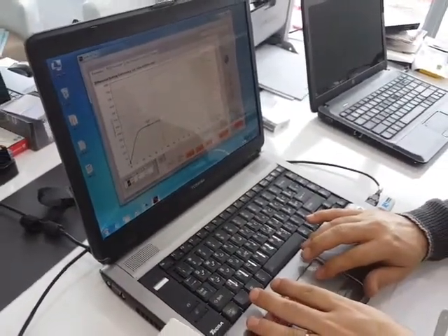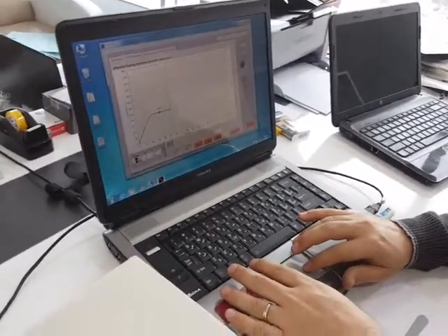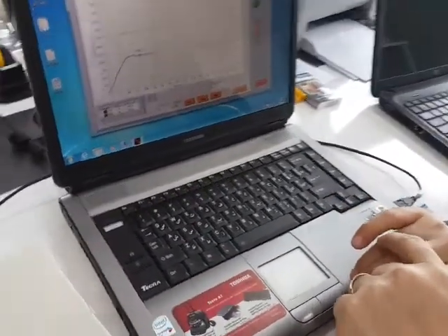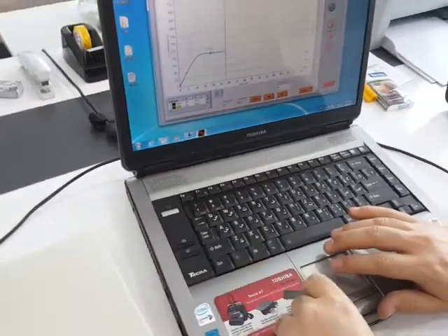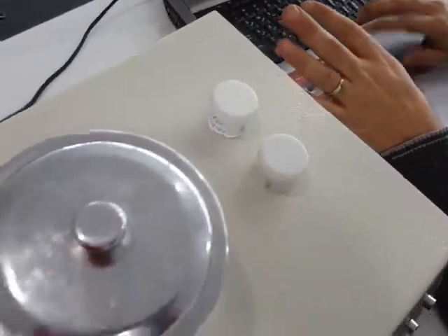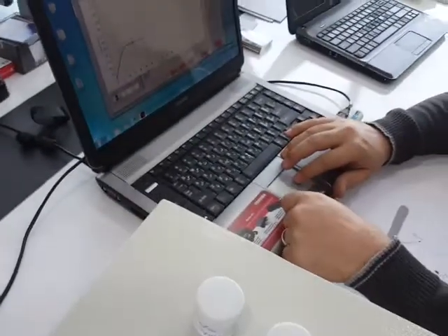We have the same situation for O2 input, oxygen input closed, nitrogen input closed. Whenever the operator wants to check if the hosing and connections of the nitrogen input and oxygen input to the chamber are working fine or not, for the oxygen check, the operator can turn it on.